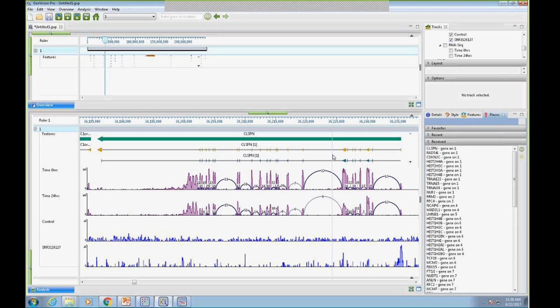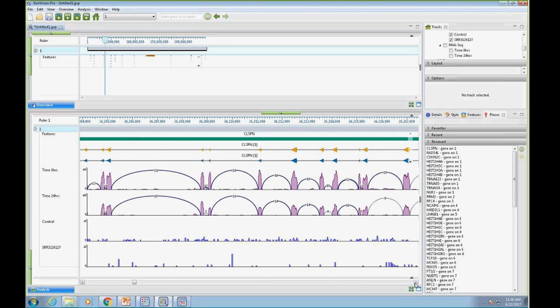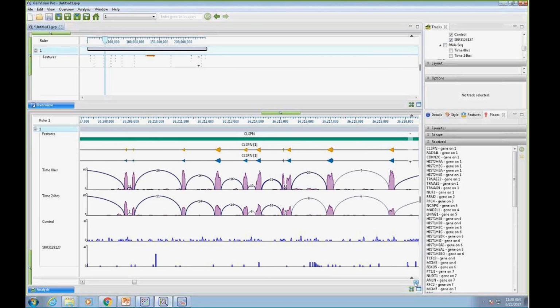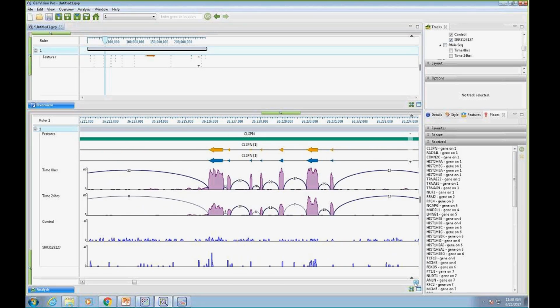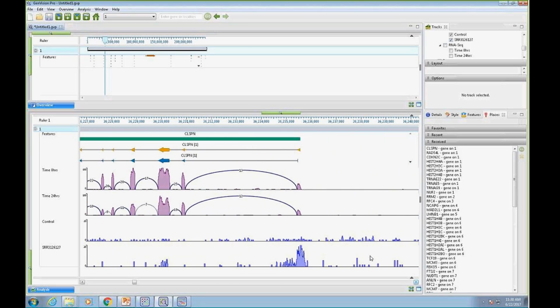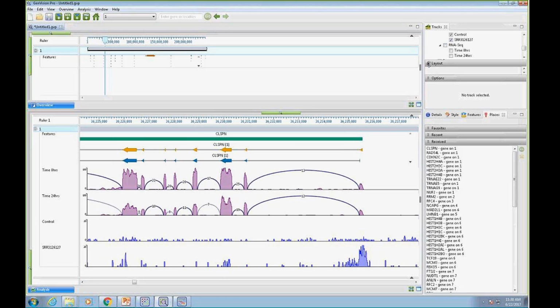I can look at this first gene, and what I'm looking at now are, first of all, what do the scales look like? Do I need to adjust them? What does my peak look like? Is it nice and distinct? And so I can very quickly evaluate. I see a pretty decent peak right there on the 5' end of this gene. And I can change the layout then.